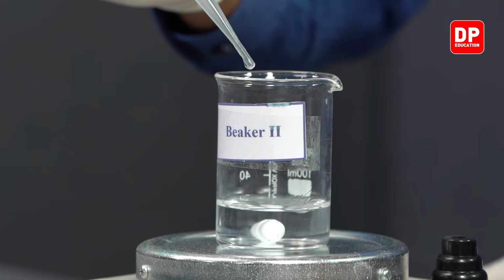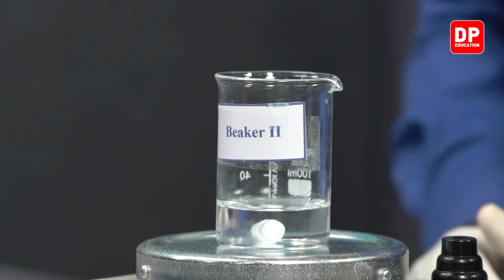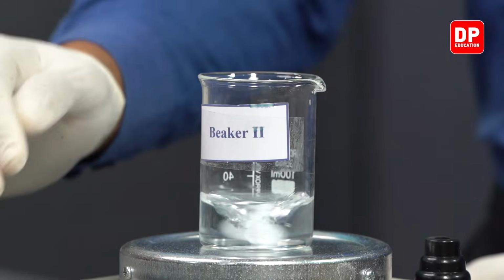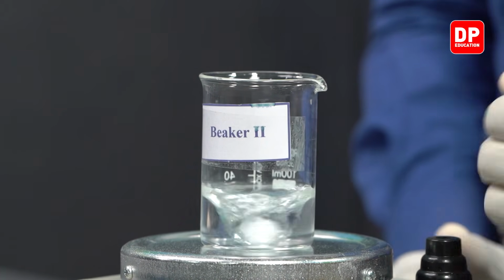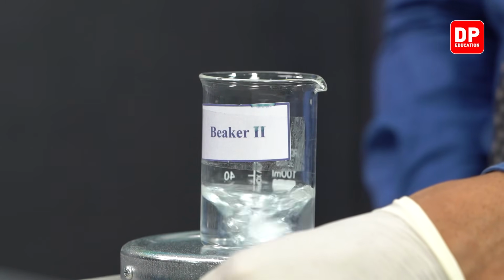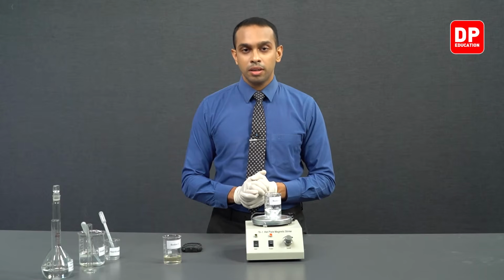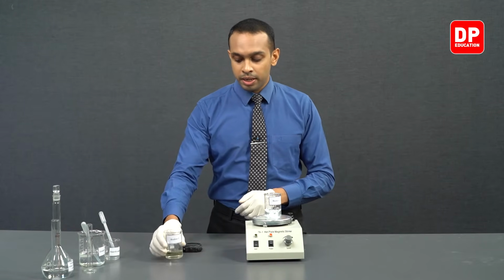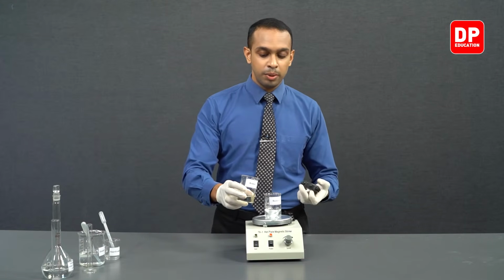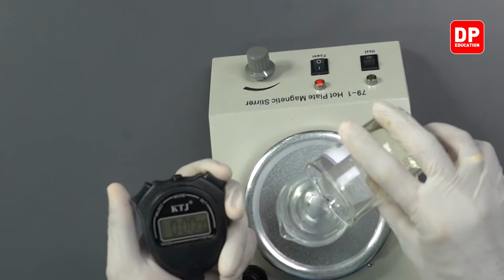We can add 5 drops of the starch solution, and then we can turn on our magnetic stirrer. Now, after turning on our magnetic stirrer, we can proceed to add contents in beaker 1 to beaker 2, and as we did in the previous instances, we will be starting the stopwatch.